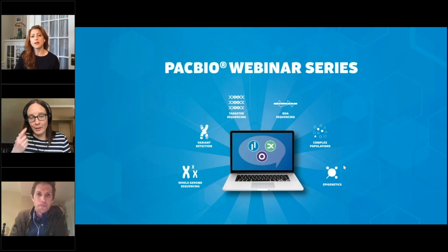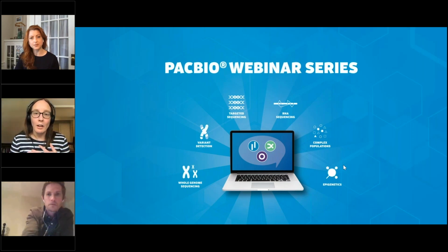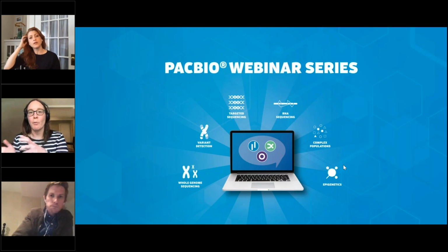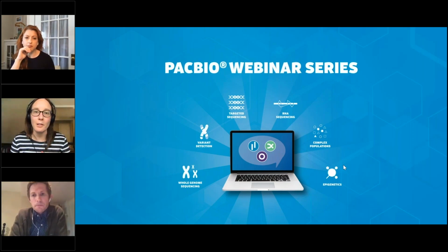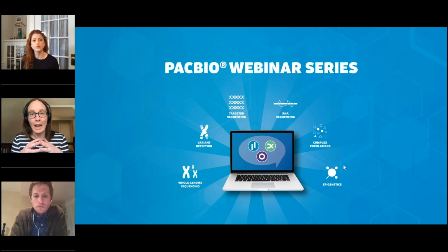Can I jump in really quick? I actually was muted. One of the strengths of the approach that Corey and I have developed is that we can look at the non-coding parts of these loci as well. Some of the imputation methods, where they take the B-cell repertoire and impute back the germline sequences, don't see those areas, and SNPs in those regulatory sequences can affect B-cell receptor and antibody expression. So being able to link the DNA and the RNA data is going to give us a lot more insight into the regulatory networks that inform and modulate the antibody response.